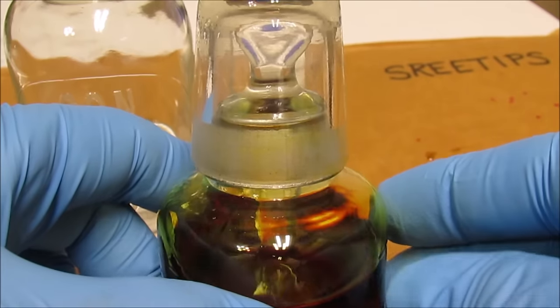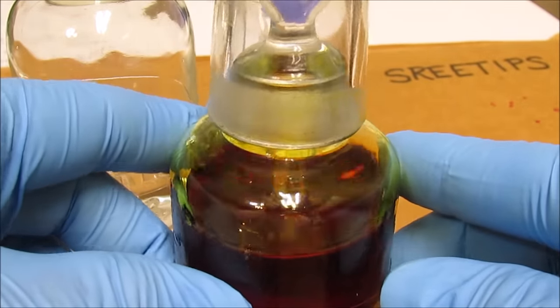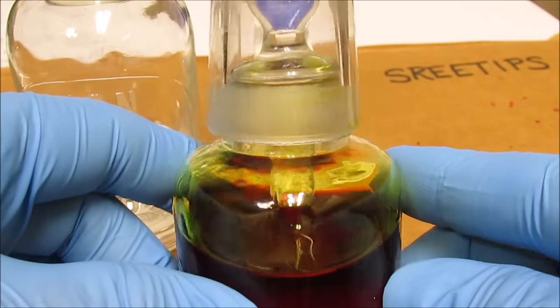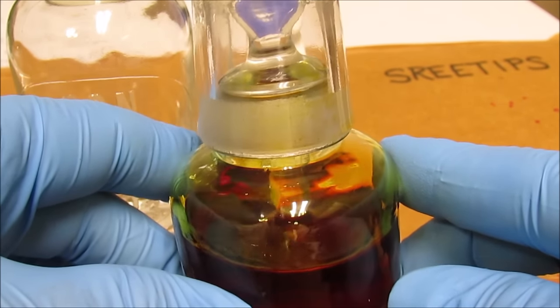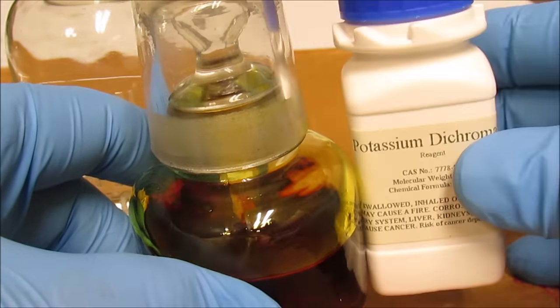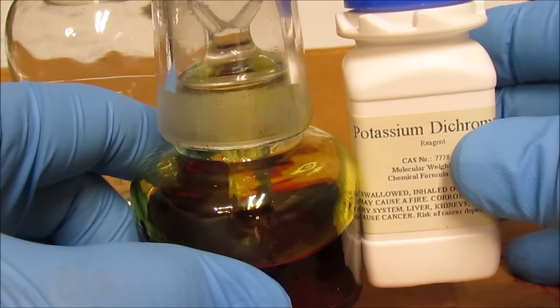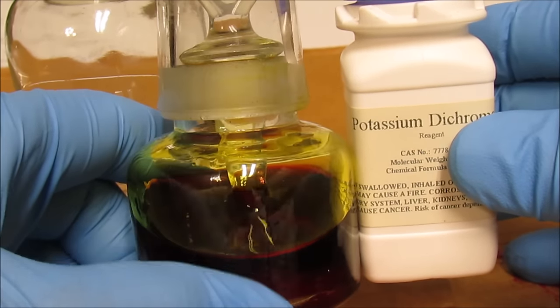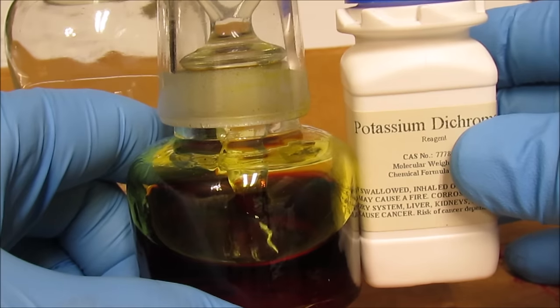One other thing I'd like to point out with this testing solution is that it does lose its potency over time. Every couple of months I add about a half a gram of potassium dichromate to the jar and then squirt in about one to two ml of nitric acid to freshen it back up. So it does lose its potency over time.